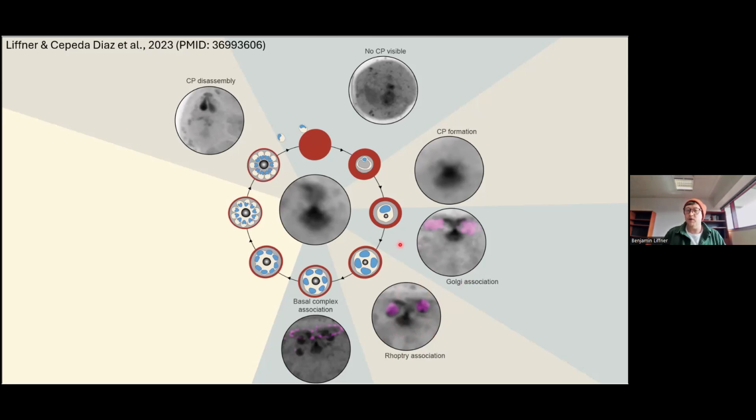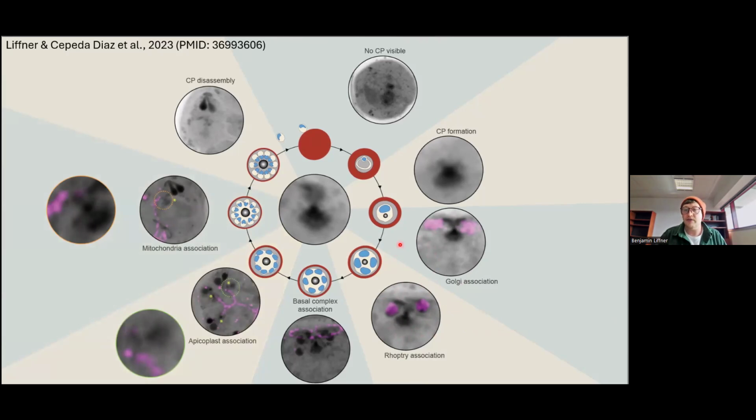And importantly and interestingly, all of these organelles coordinated their duplication and their inheritance with centriolar plaque duplication and separation during mitosis. And then finally, we showed that these two branched organelles, a parasite-specific organelle called the apicoplast, and the mitochondrion, attach a branch to the outer centriolar plaque of each forming merozoite. We think that this enables appropriate distribution, fission, and ultimately inheritance of these structures during cytokinesis.